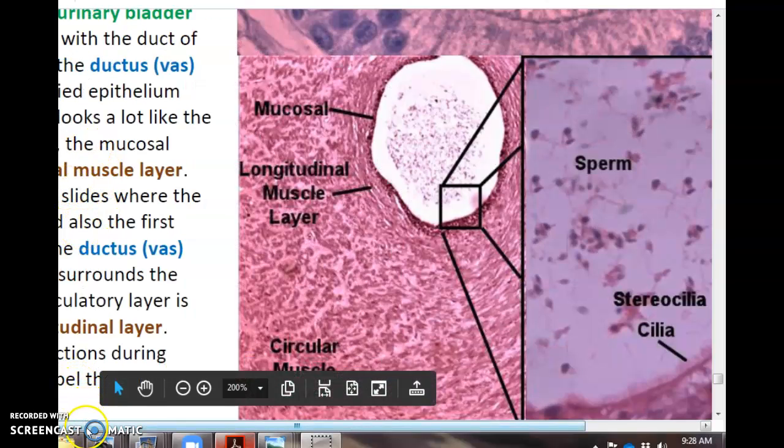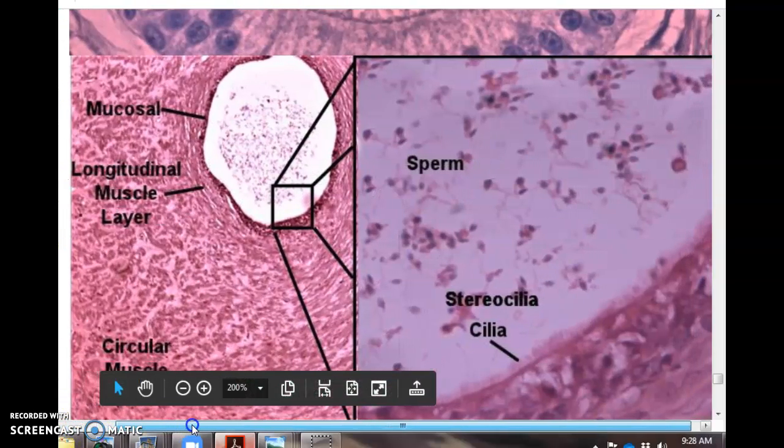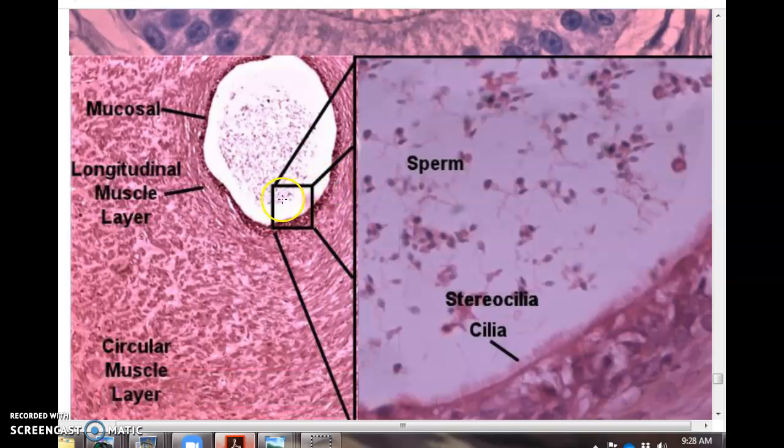Welcome to the second part of our video for the histology for today's lab. Now, in this histology, we are going to look at two structures. They never really focus on the lab exam, but they're very interesting to look at for things we actually have been covering and to reinforce points. So here's the first one.